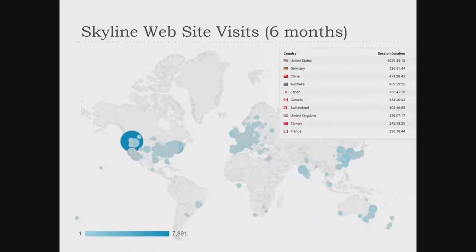It's also incredibly worldwide. You could go get a job anywhere. I knew a guy, I think he came originally from Europe, one of the first people using Skyline as part of the CPTAC consortium from Europe, Pavel, and he was in New York, and now he's down in Queensland, Australia. And he's been using Skyline the whole time.